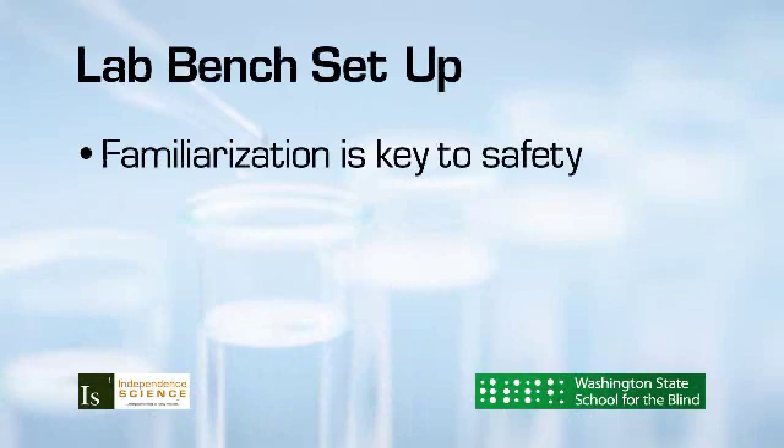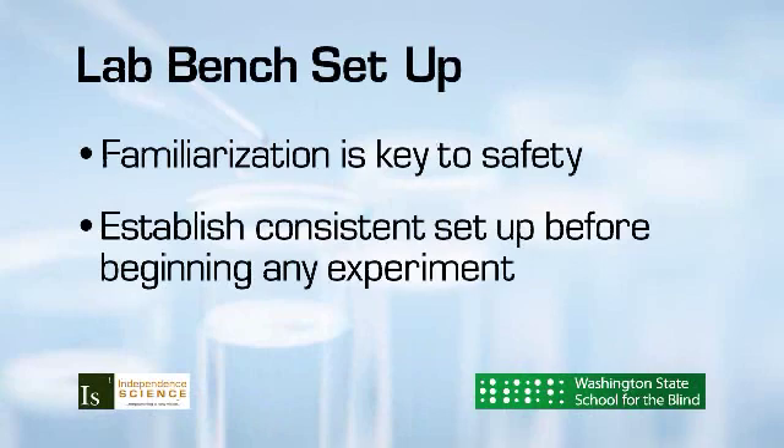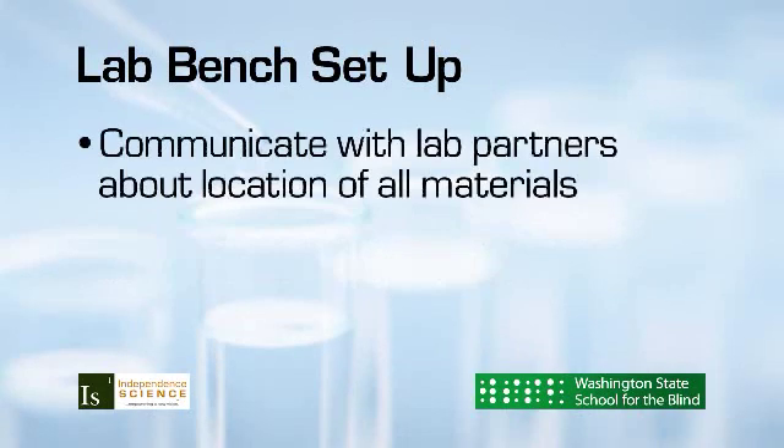The student must review and be comfortable with the lab procedure before entering the classroom, as well as being familiar with the layout of both the classroom and the lab. Familiarization with the lab bench setup is necessary to provide a safe experience for the student. A consistent lab bench setup should be decided upon and reviewed prior to beginning any experiment. If working with a partner, there should be open communication about the location of any lab materials.